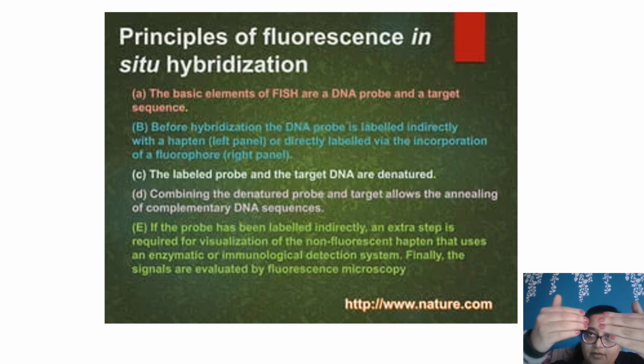There will be a reaction when this complementary DNA labeled with a fluorescence probe present in the kit goes and attaches itself to the strand which is mutated in the human body. And like my pink nail polish, a green or an orange signal will be emitted, and that is what you see in a microscope which has filters to observe these fluorescent images. So this is a very layman way of explaining what FISH is and how we observe FISH in the microscope, right?